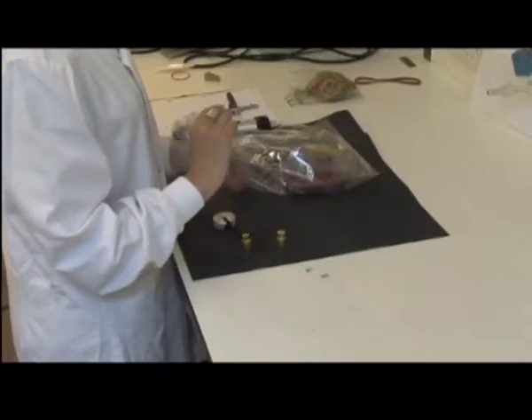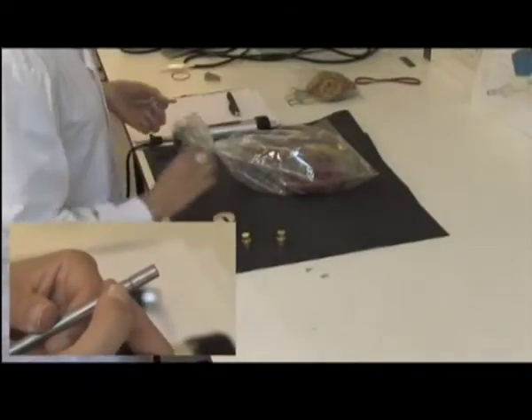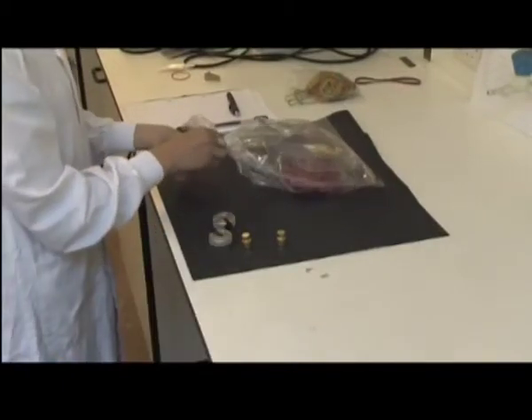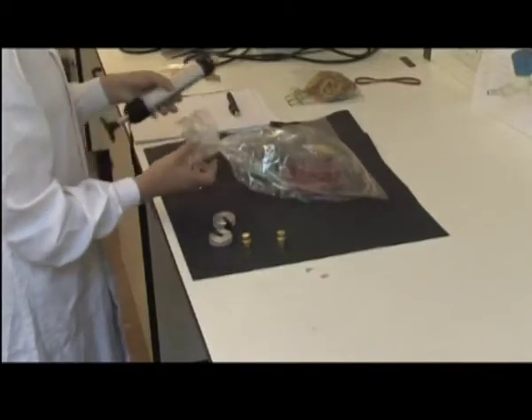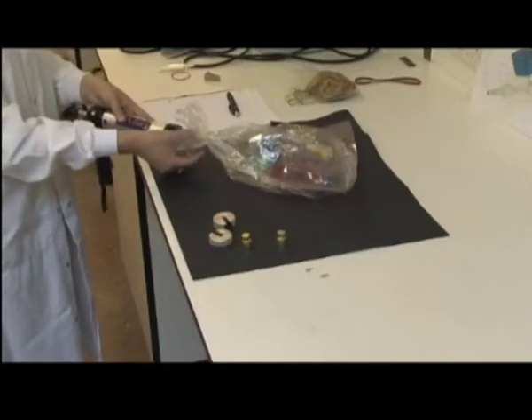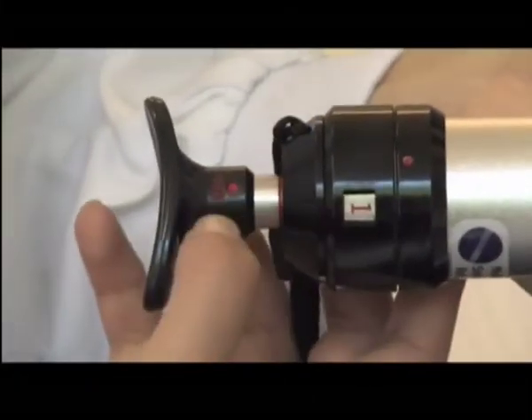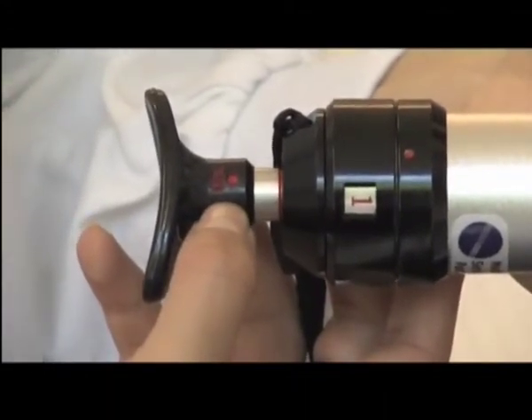Insert the tube into the bag with the grooved end facing into the bag. Attach the pump by pushing it onto the tube. Make sure that the red dot on the pump body and the 100 milliliter mark on the piston handle are aligned.